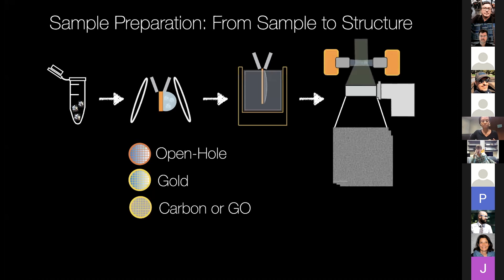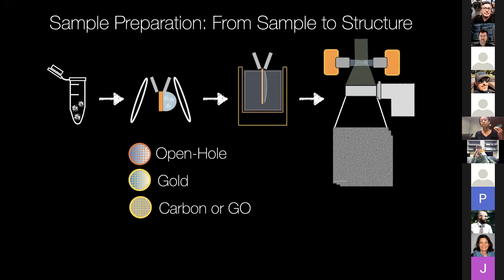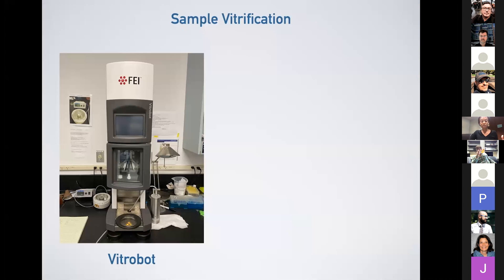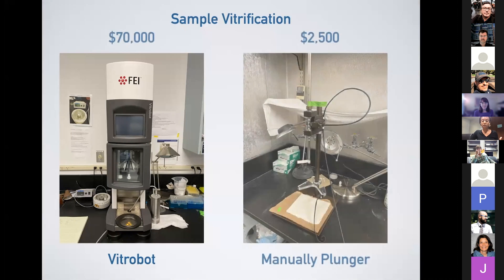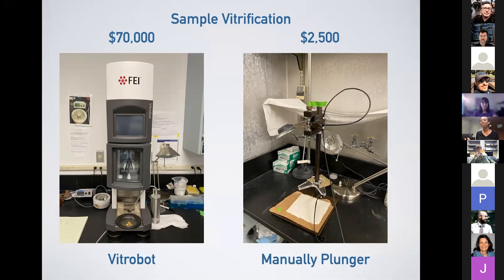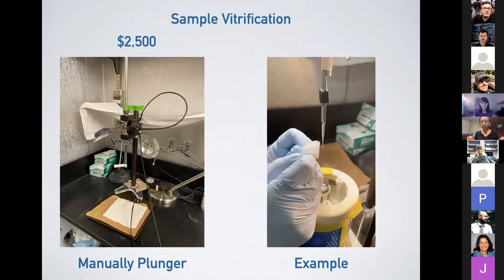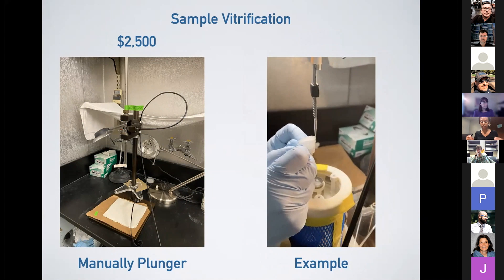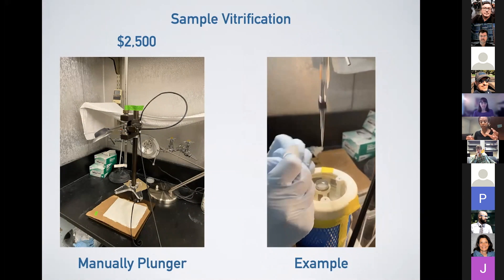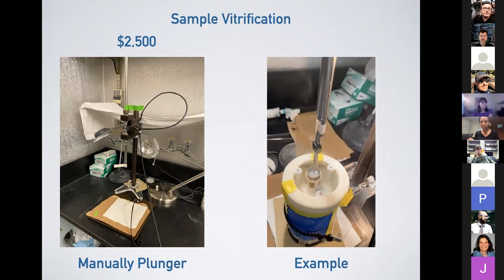I am very happy to talk about why we use graphene oxide grids in our lab. With that, you have a rapid vitrification process of your sample into liquid ethane, which you then wash in liquid nitrogen, and it's ready to be imaged under the scope. Here I'm highlighting our Vitrobot, which is the tool we use to prepare our samples, and I want to contrast that — especially financially — with the manual plunger we've developed in our lab. In this video you can see the blot paper used to carefully blot away your sample from the grid, held by tweezers, which is then rapidly plunged into liquid ethane. What's really essential is that the time your sample is exposed to the air is limited — that's really important, and I'll talk about why.